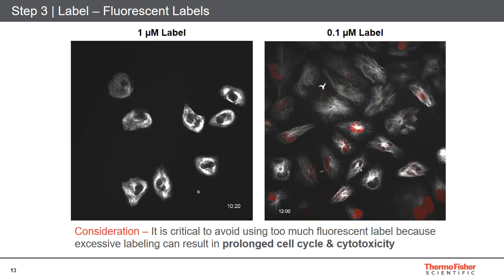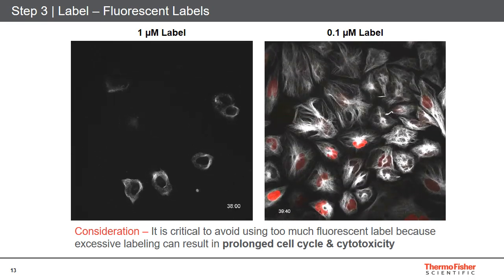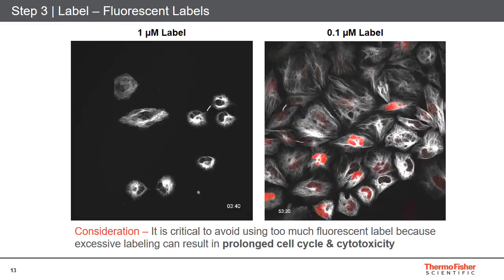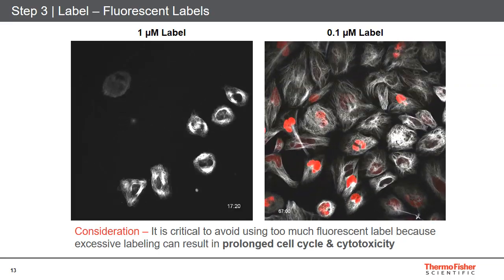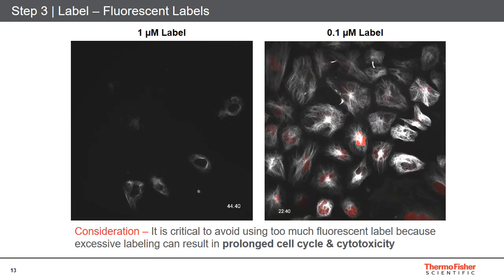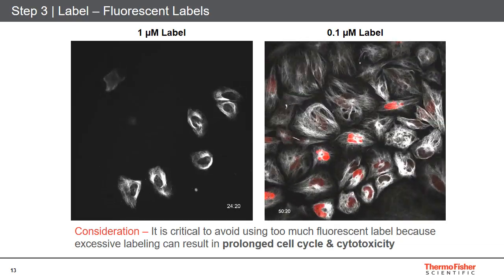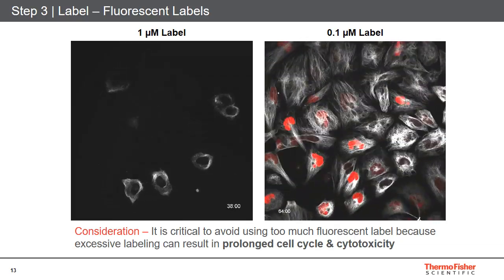So it's a very important consideration when using these types of labels for long-term time-lapse imaging to make sure that you do not excessively label, because the dye itself can of course interfere with and perturb the natural physiological mechanisms of your cell type.